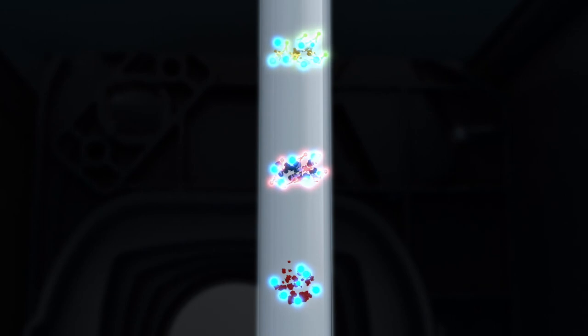Best of all, Jess's fluorescent detection capabilities enable two-color protein detection for multiplexing, on top of protein normalization.